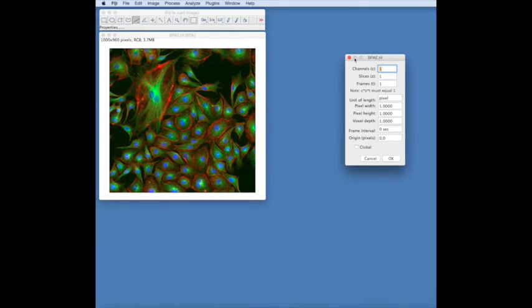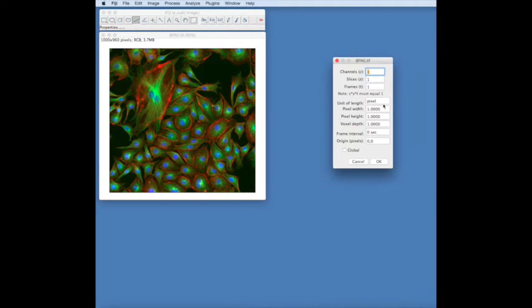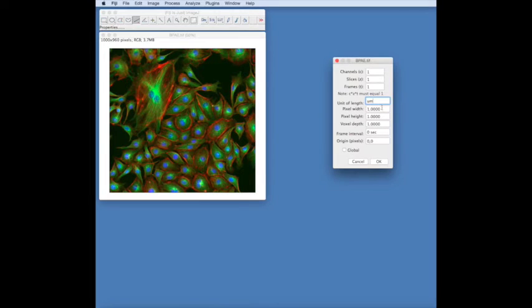By going to Image Properties, we can change this from pixels to microns, to millimeters, nanometers, whatever you choose.